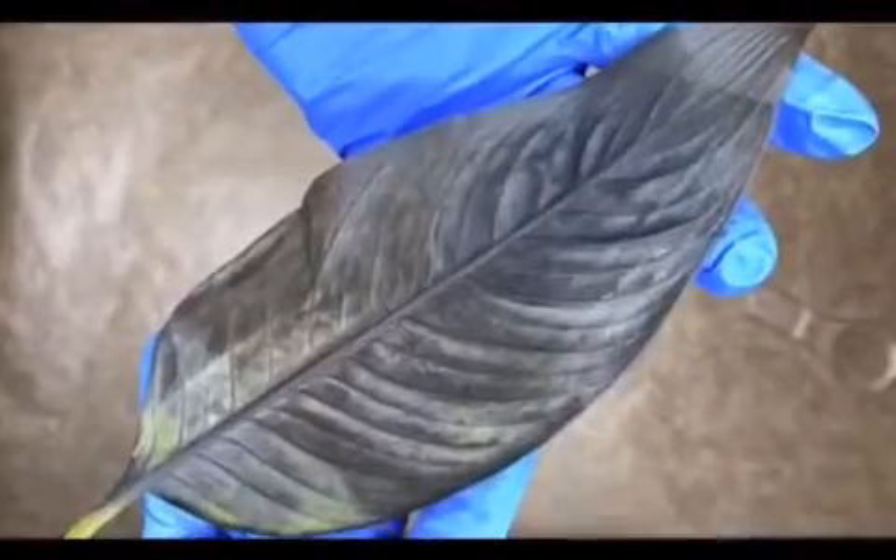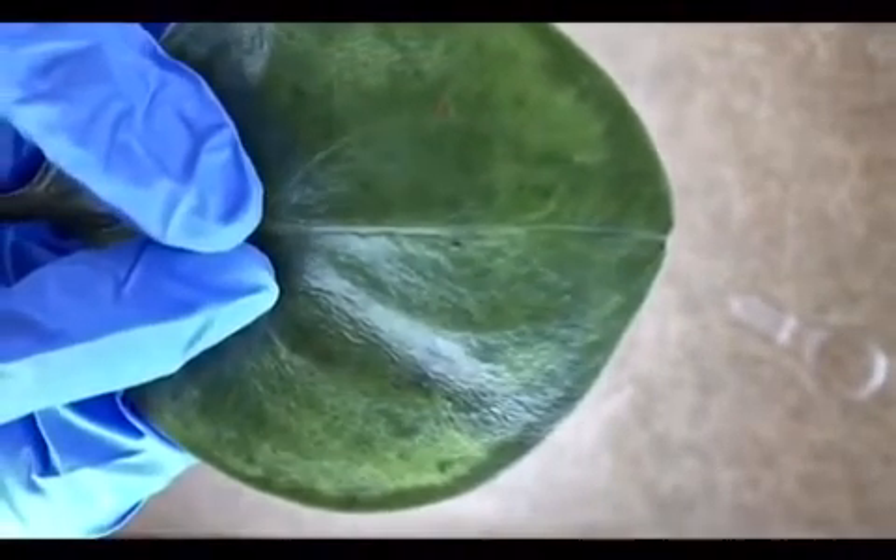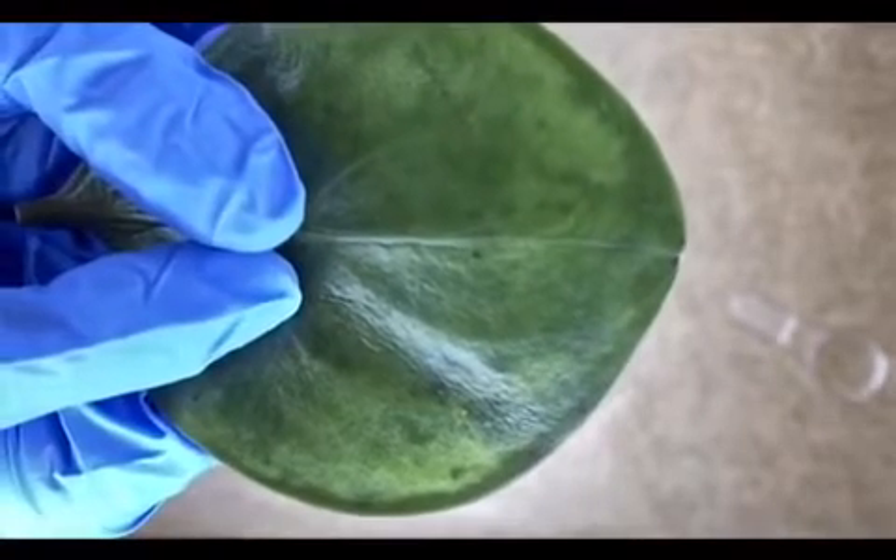For the first leaf, it was the thinnest of all, so the membrane broke easily and the leaf turned blue-black, which matched my prediction. The second leaf worked a little less, but still worked, and as you can see it turned blue-black in some parts.